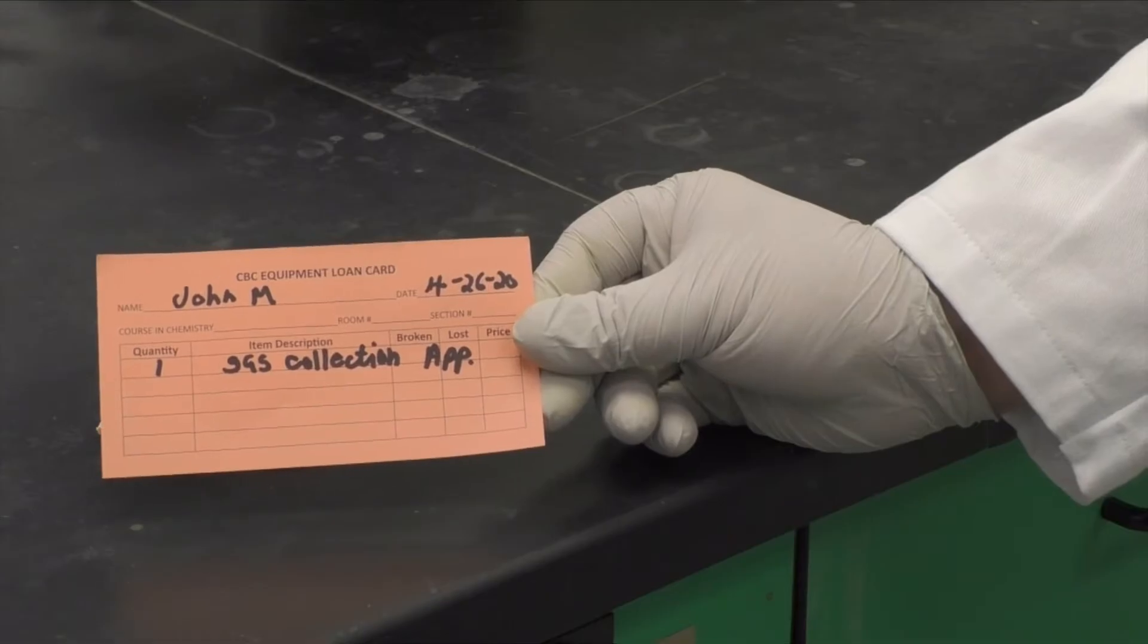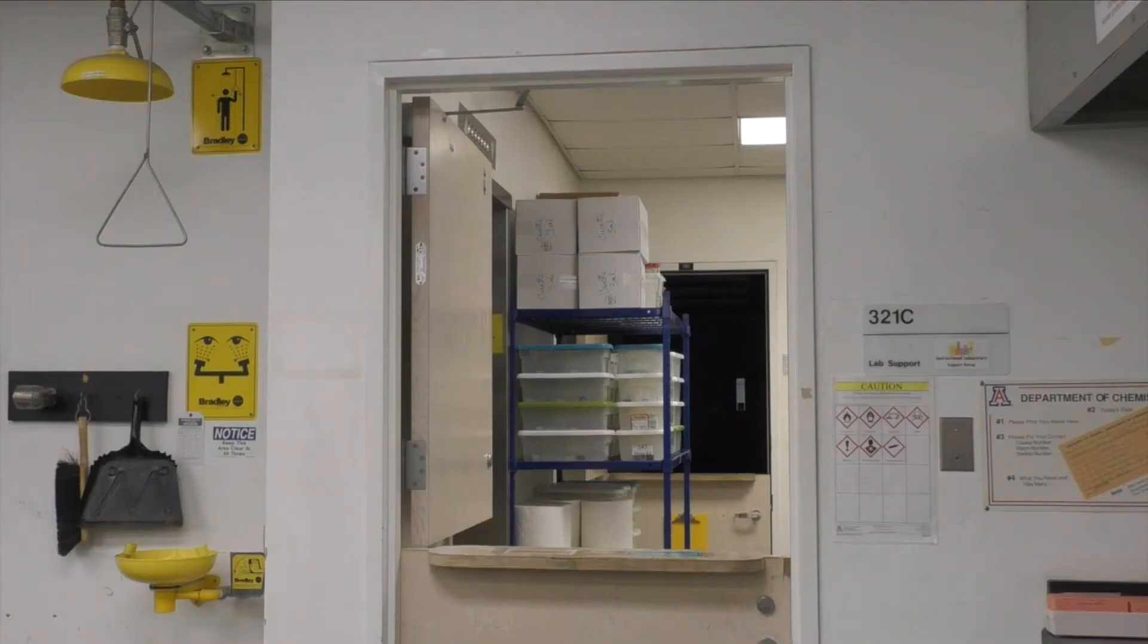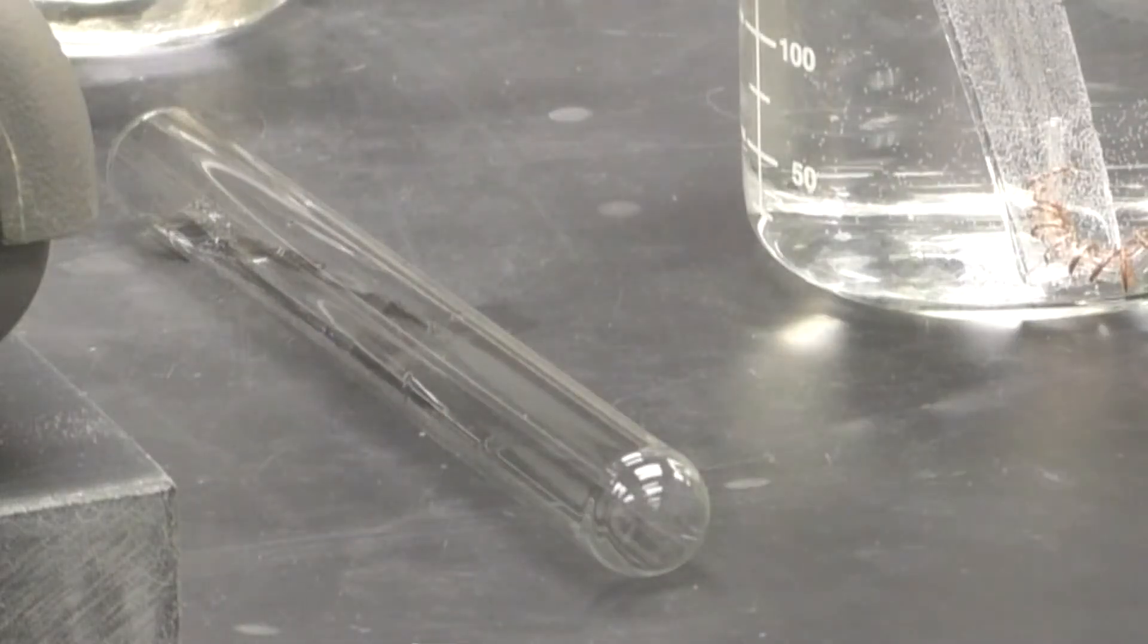To start, check out a gas collection apparatus from the ILSG window. You'll also need to obtain a 6-inch test tube.